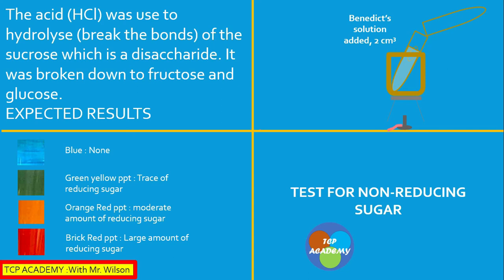Follow the screen closely to ensure you document the most accurate observations for your report. The bonds of the non-reducing sugar will have been broken by the high temperature and hydrochloric acid, so we now expect the content of the tube to be reducing sugar. We heat the mixture and look for the same color change as in the reducing sugar experiment carried out earlier.